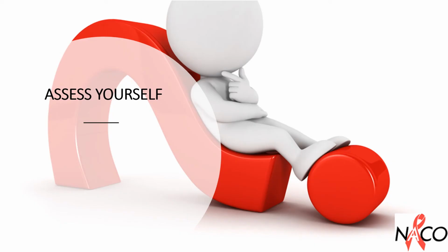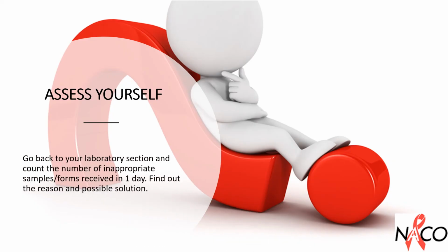Go back to your laboratory section and count the number of inappropriate samples or forms received in one day. Find out the reason and the possible solution.